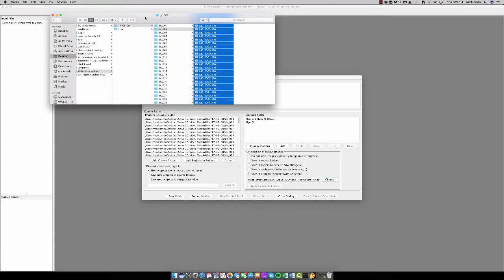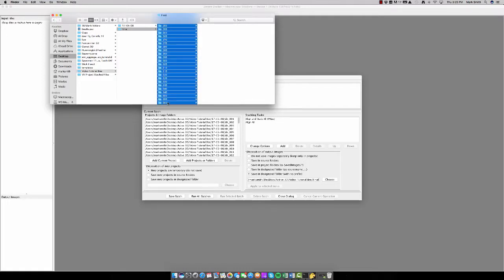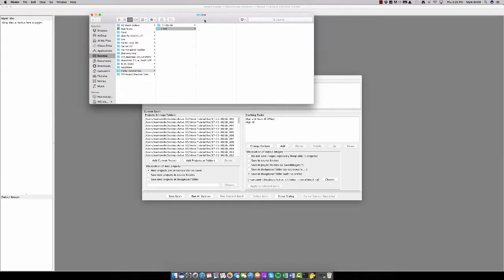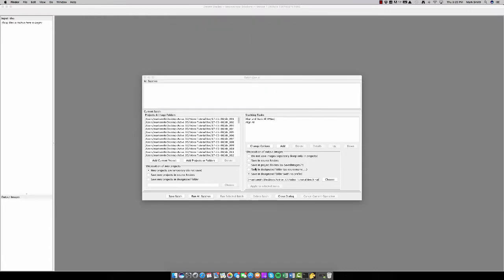Because I didn't use the 0 to 360 folder templates this time, these are all empty. I'm just going to get rid of these, and now this final folder is where all of my final output stacked photographs are going to be. So at the end we're going to have 72 final output photographs situated right here in this window. Okay, so that's set up.